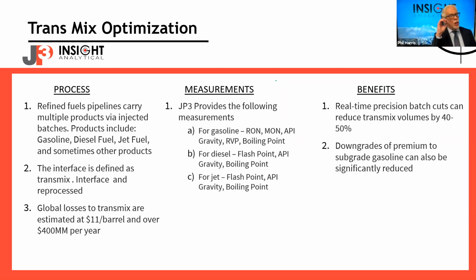Yeah. And so the way I look at it, Dirk, is if I was doing custody transfer, if I'm going to do a custody transfer agreement between you and I, we'll probably pull a sample and send it to the lab. Correct. But if I want to do process control to predict whether I'm going to sell Dirk some condensate, and he wants to know it has a vapor pressure less than 100, and I want something that can give me a data point every 15 seconds to tell me if I think I'm on spec, that's where the analyzer shines, process control.